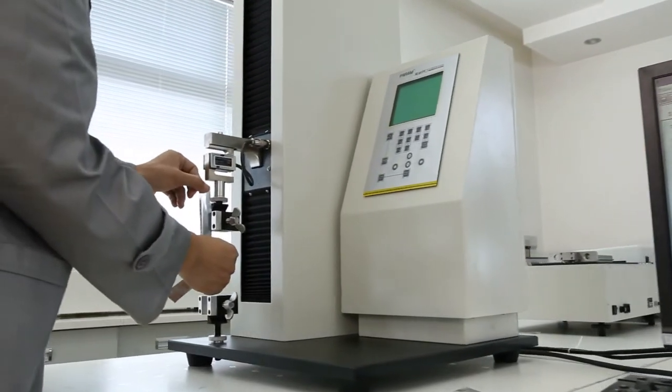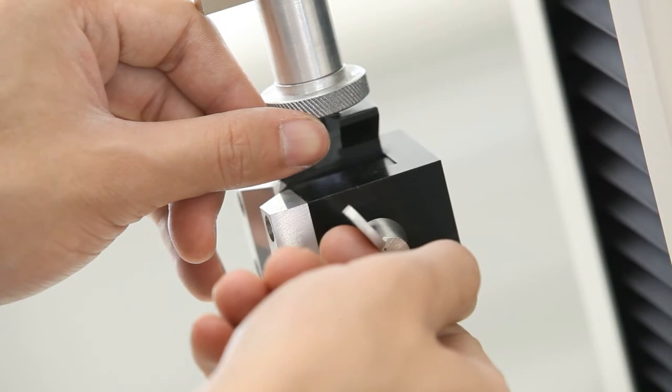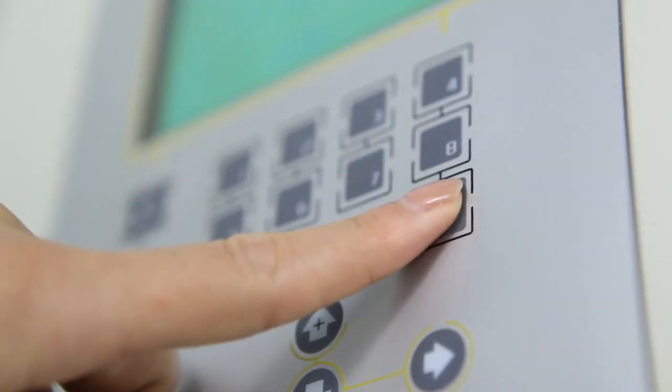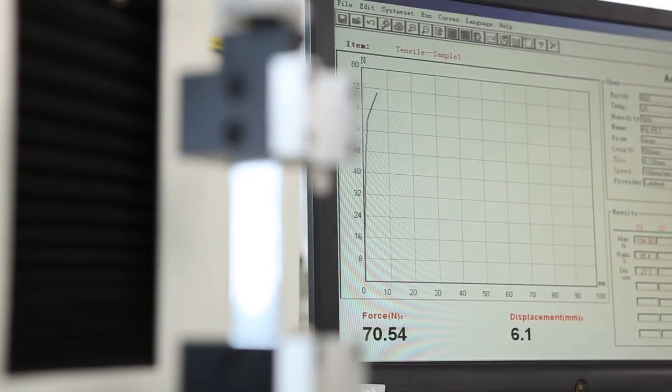Users only need to place the prepared specimen on the fixture, complete the parameter setting and click on Test. The XLW-PC will then accomplish the test automatically.